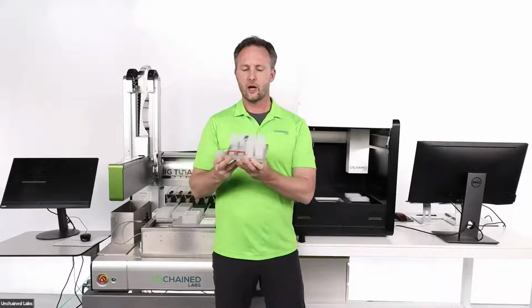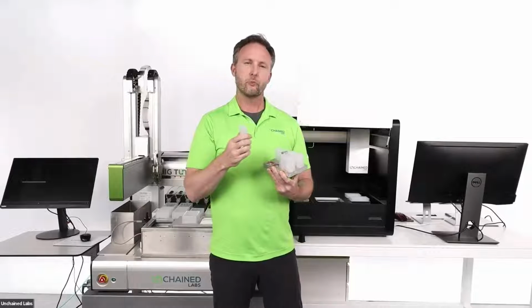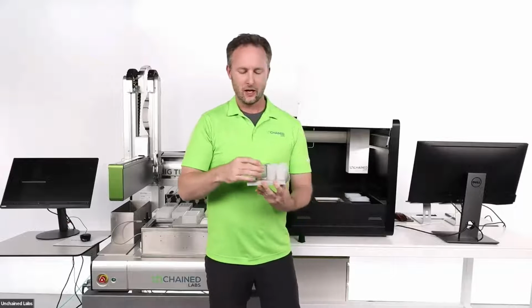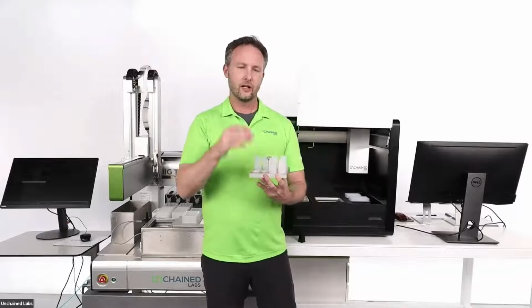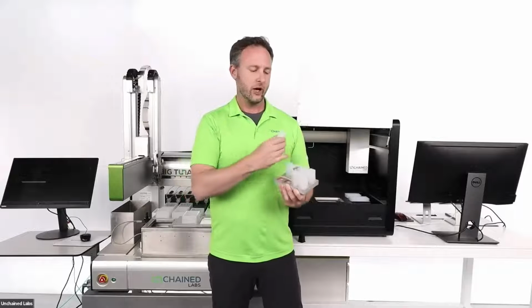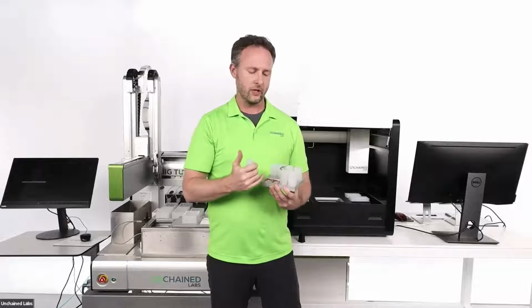This is nice. I like this feature a lot because you might be working at your bench, perhaps down the hall. You can prep your Unas for use and then load your samples into them. But instead of trying to carry all those things down the hall, unless you're a juggler like my colleague Ross, you can just put them right into the sample rack and carry them on their way. So you have up to 8, so you can run 1 or any number all the way up to 8.